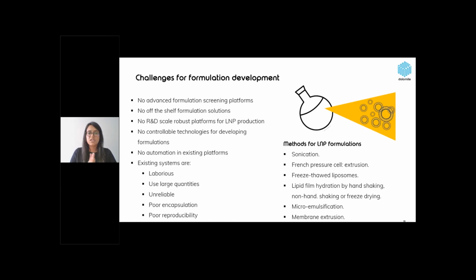Some of these existing platforms are listed over here, and some may be familiar to you and maybe you have used these in your experience in the past. And certainly most of these methods are laborious. They have huge quantities that you have to work with.